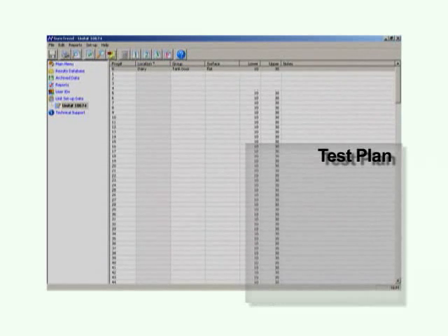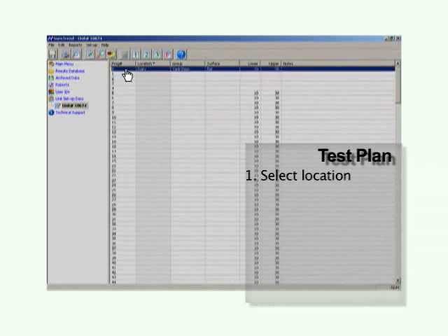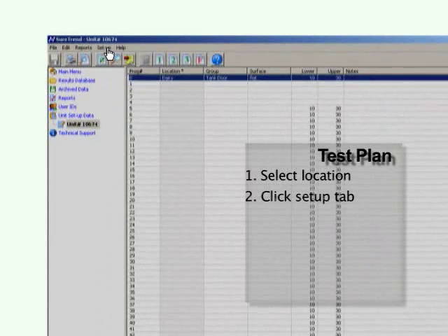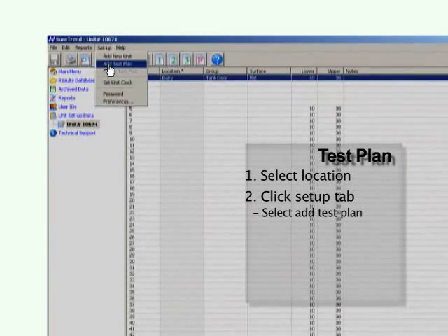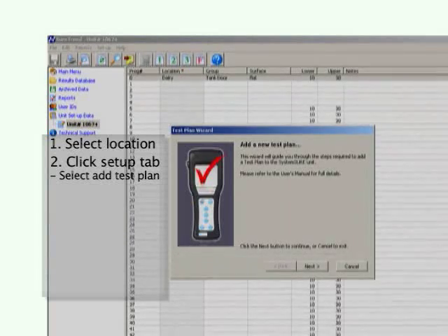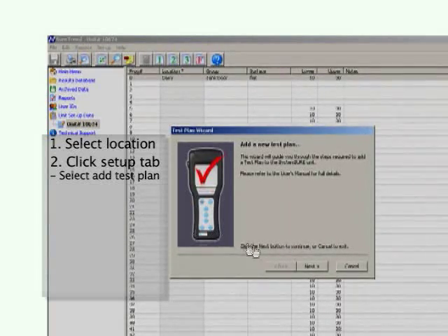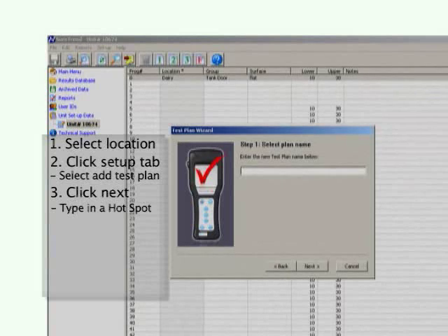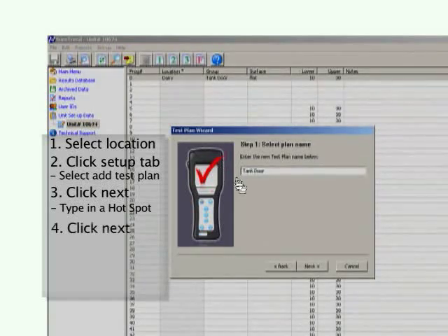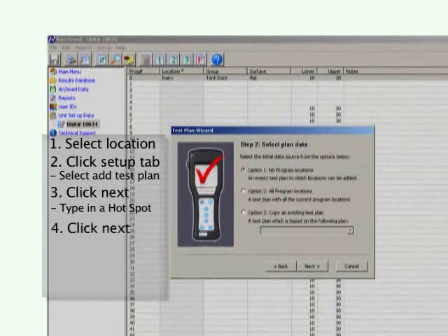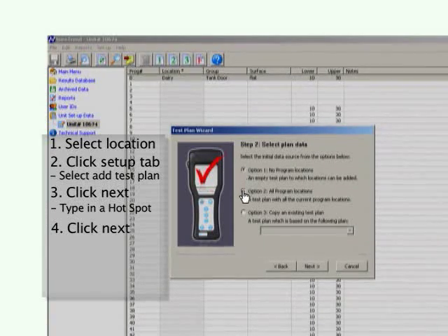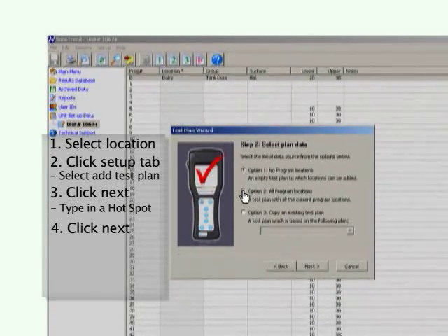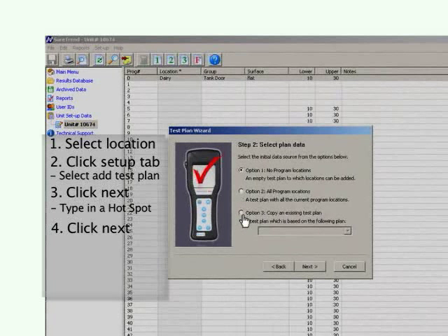To do this, while still in your unit number screen, simply click on your location, click the Setup tab, select Add Test Plan, and this screen should emerge. Click Next, and then type in a hotspot. A hotspot would be a test location, product run, line number, or even a day of the week. Click Next and three options emerge: Option 1 allows you to add locations to an empty test plan, Option 2 assigns all your program locations to a test plan, and Option 3 copies an existing test plan.